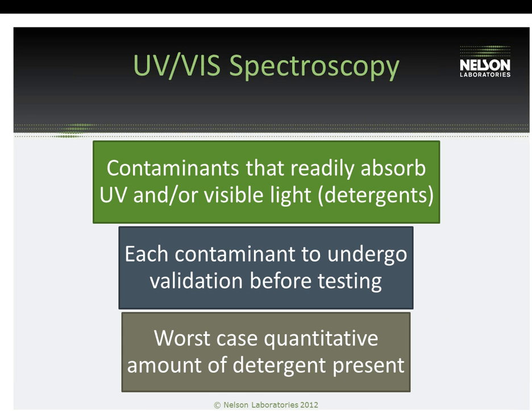There are some limitations with this test in terms of the contaminant has to be water soluble, and we have to be able to validate it on our instrument. However, it's very specific in looking at that detergent or that particular contaminant. And so this is a great test option, especially when you're trying to look at your detergent specifically.